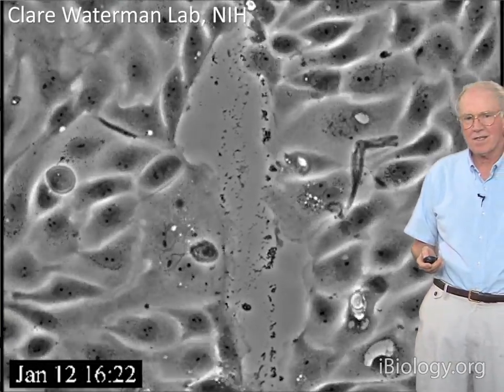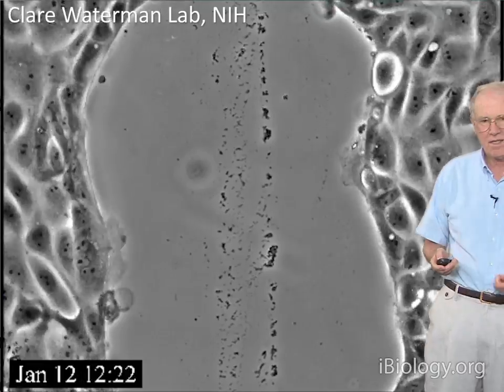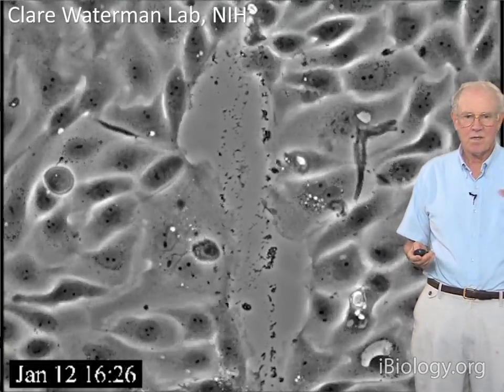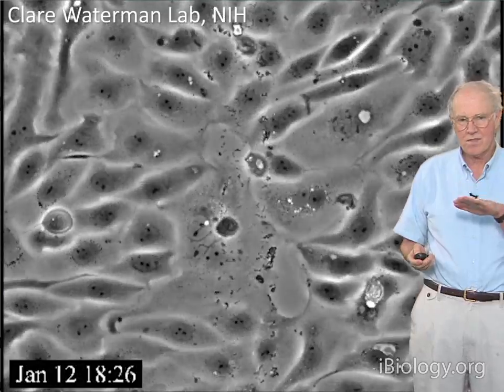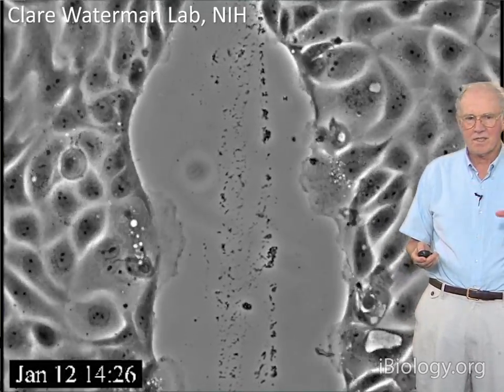Another routine use of phase contrast is assaying the problem of wound healing. And this is studied in tissue culture, where cells are grown out to confluency on the surface of a dish, or a cover slip surface.